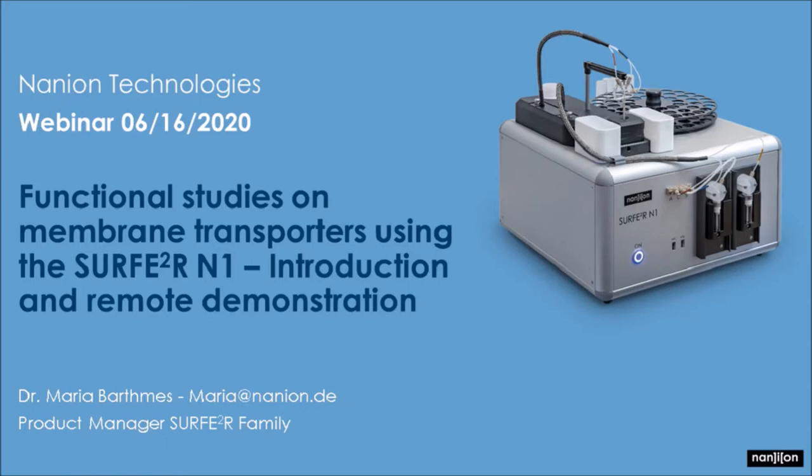Today's presentation is as follows. Maria will provide an introduction covering the basics and principles behind the technology at great depth. Additionally, she will look at practical topics like preparation of samples and experimental workflows. Finally, Andre will introduce some datasets to highlight the potential and possibilities for membrane transporter studies. As such, we have prepared a remote demonstration from our in-house lab and will provide live commentary.